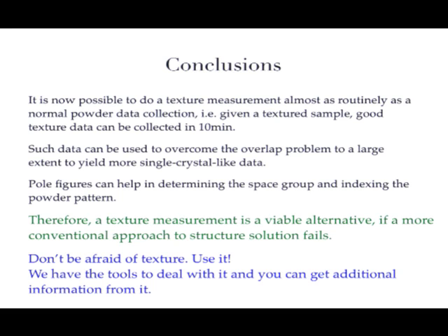I mean the reflection geometry, of course, and transmission is more or less the same. I'm not sure I understood exactly. But you're asking about the volume. Okay, my question is about the footprint issue. In case of reflection geometry, is it not considered the gauge volume, which is the diffracting volume, rather than the footprint?